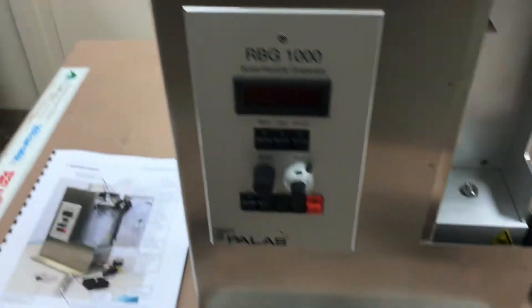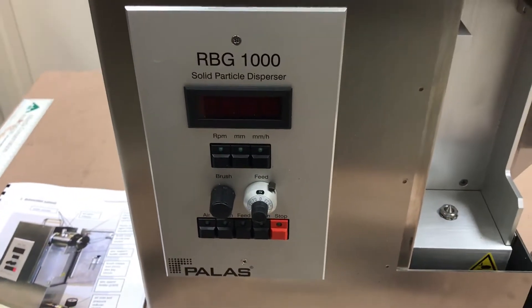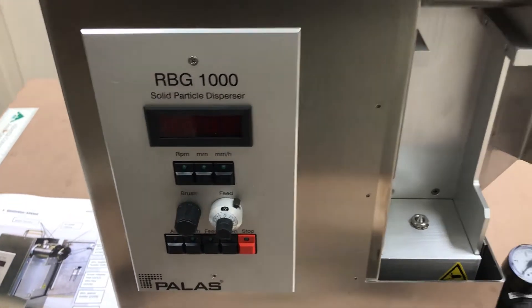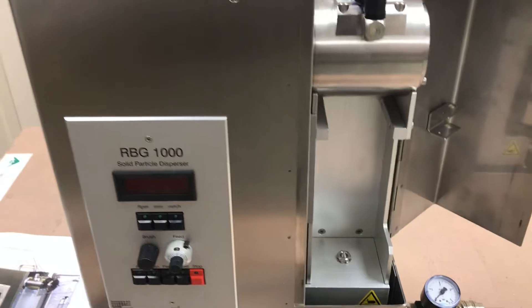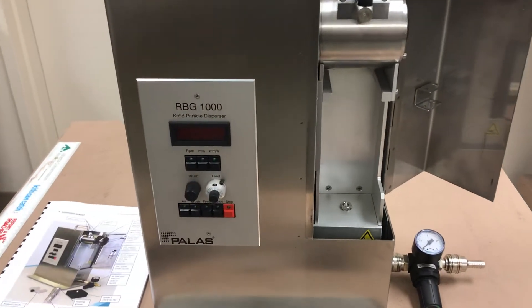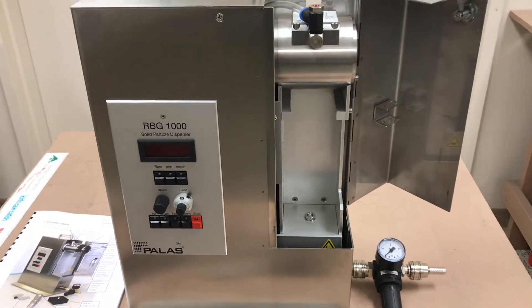So again, this unit is a solid particle disperser made by Pallas. Common media used are KCL and NACL, and it's used to test filter media. CDNova is a distributor for Pallas out of Karlsruhe, Germany. If you have any questions, feel free to comment. Thank you.